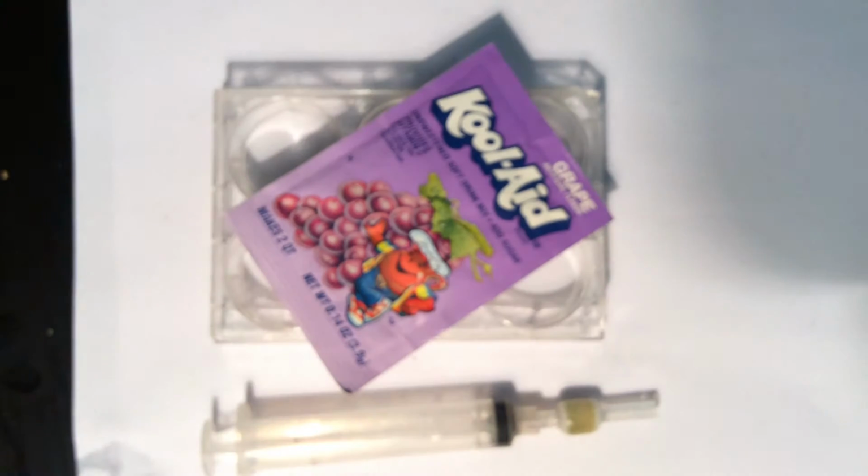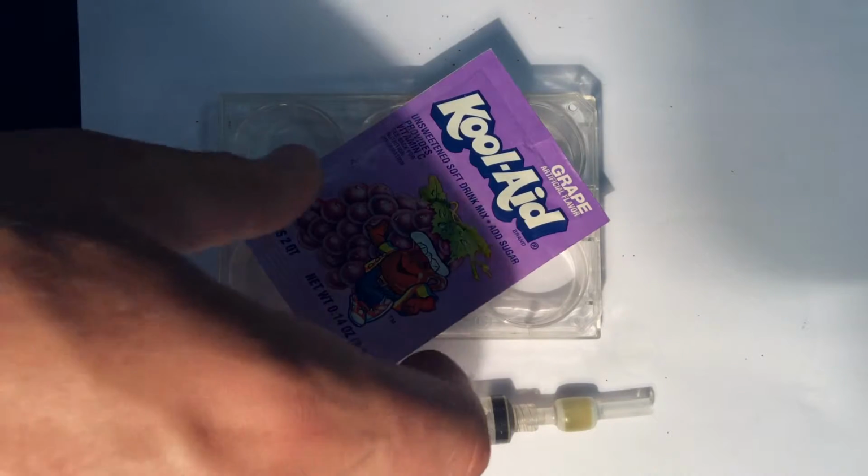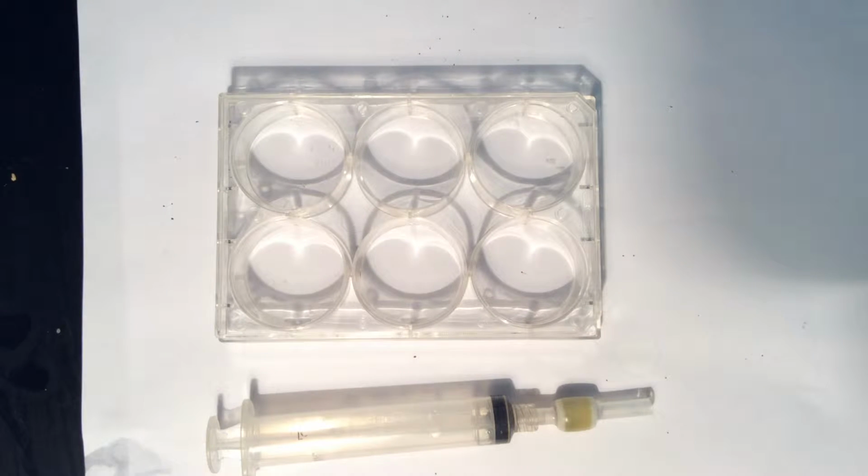So what we're going to do is separate the colors based on chromatography, or at least based on what? Solubility. Chromatography is giving the chemicals a choice. If I'm more polar, I'm going to stay with the more polar phase of the chromatography. If I'm more nonpolar, I'll go with the more nonpolar phase. And that's what we're going to do here. But today I'm not using a TLC plate, I'm using a column.